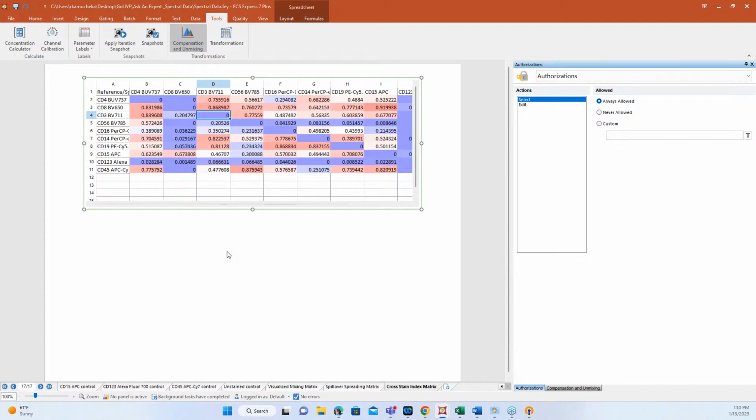The software is never going to tell you this particular unmixing matrix number is bad or good. Ultimately, those are decisions that you need to make about your own data. But it's more to draw your attention to what these numbers are and whether they're increased or decreased, just so you can get an idea of what's happening with your calculations.